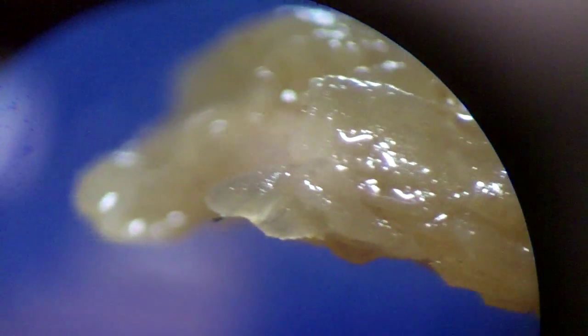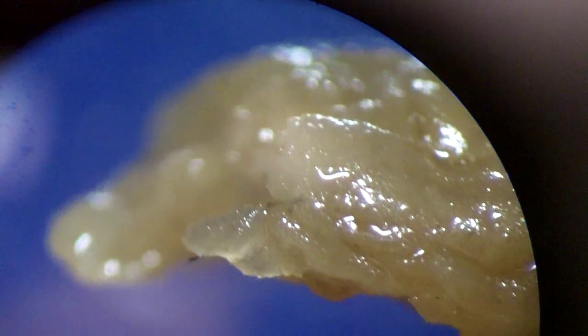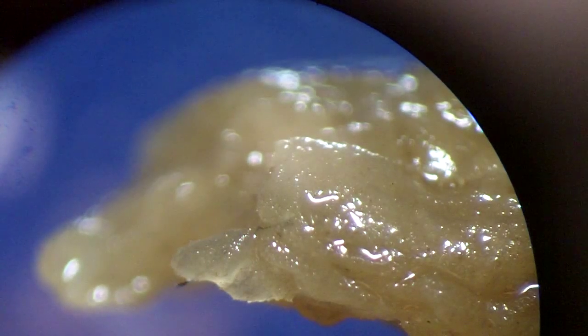It's going to be a tiny little thing inside of it. You have to literally look in between the cells, and not all of the slides are good, but if it's there, it's pretty clear because you can kind of see an open capsule — it's a little bit darker. I'm not sure. No.